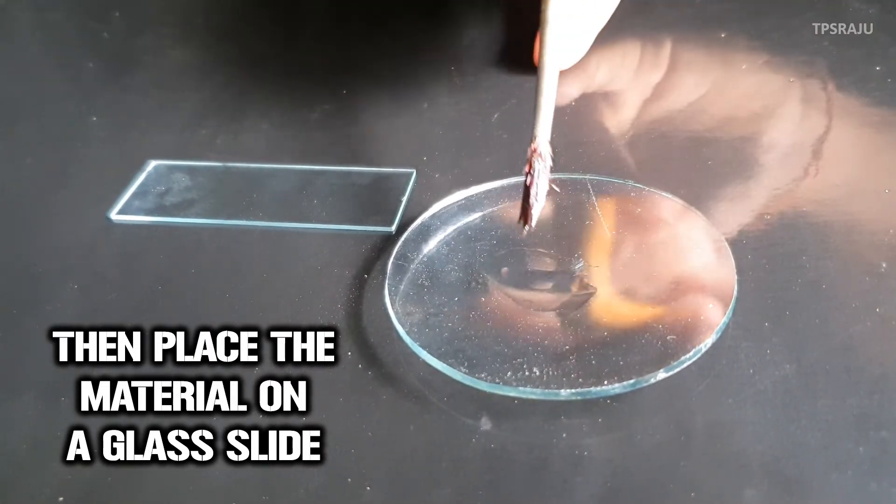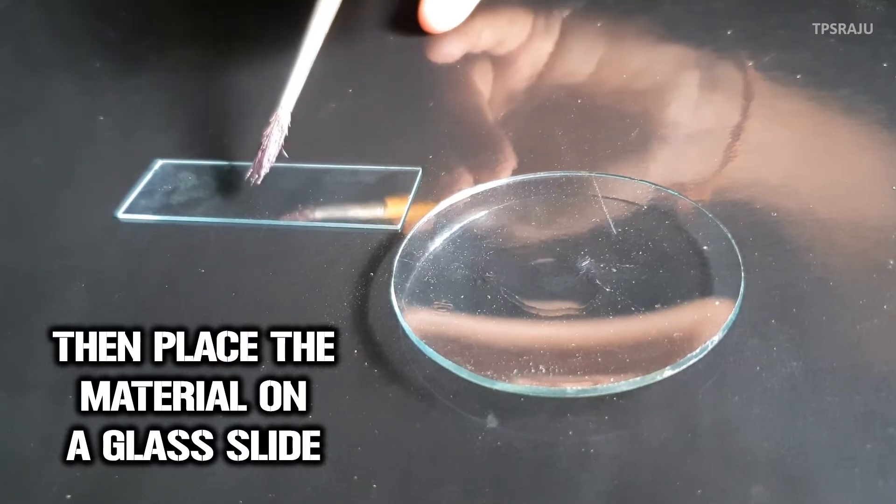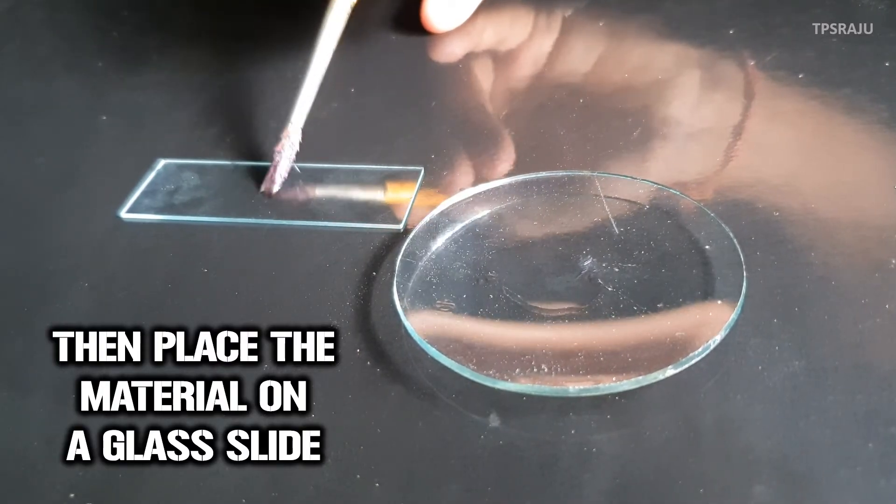Then, carefully transfer this material onto a glass slide by using a brush.